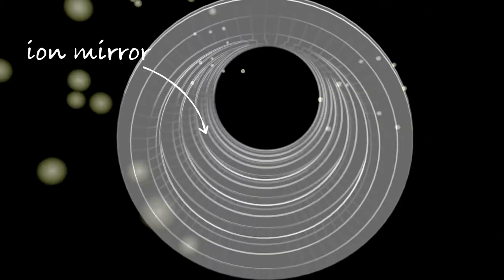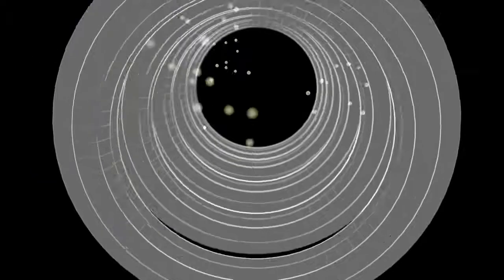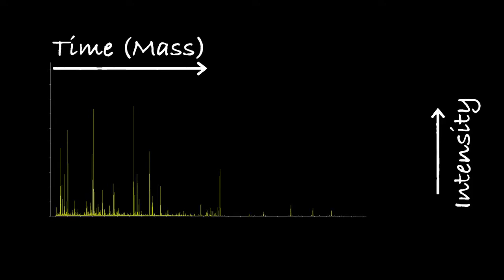The peptides are reflected toward a detector by an ion mirror, increasing the distance the peptides travel. This increases their separation, with larger peptides arriving later than the smaller ones. The time of flight to reach the detector corresponds to the mass of the peptide, and the resulting image is a series of peaks indicating both the mass and the intensity of the detected peptides.